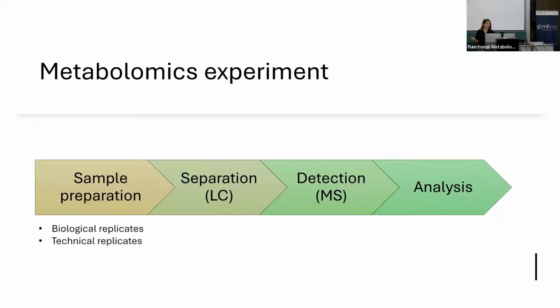So besides that, of course, it's very, very important to use biological replicates and technical replicates. Before preparing for this summer course, actually, I thought that using 3 replicates was fine, and that's how many I used in my experiments. But there's a lot of papers that really say that 4 is the minimum. Anyway, I can't redo my experiments, it's too late, but not too late for you.